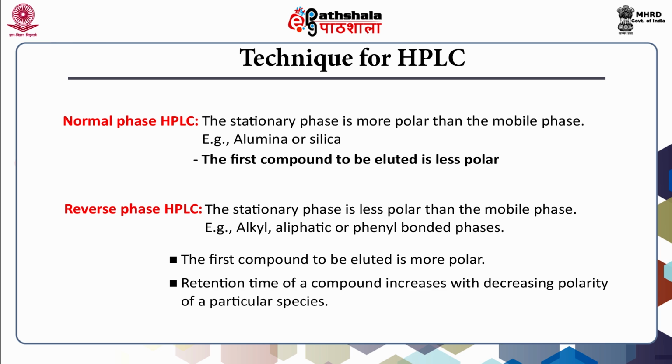So, that is about different techniques of HPLC based upon the mobile phase and also based upon the stationary phase. So, let us see what are the properties of the stationary phase in case of HPLC in the next slide.